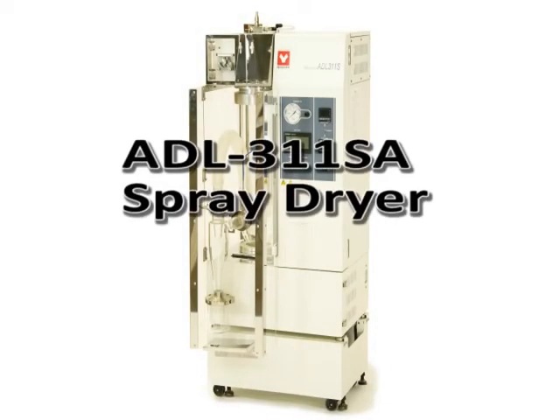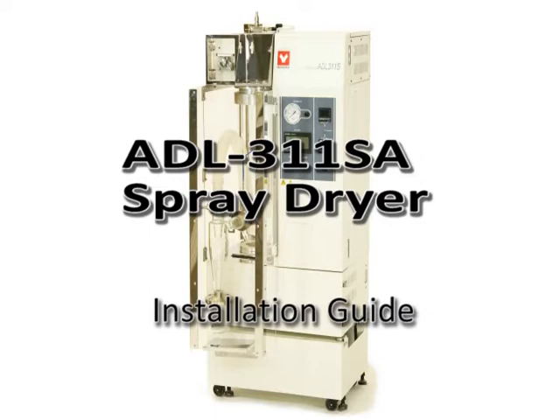Thank you for using the ADL 311 SA spray dryer. This video will cover basic installation and setup procedures, as well as technical and safety guidelines.